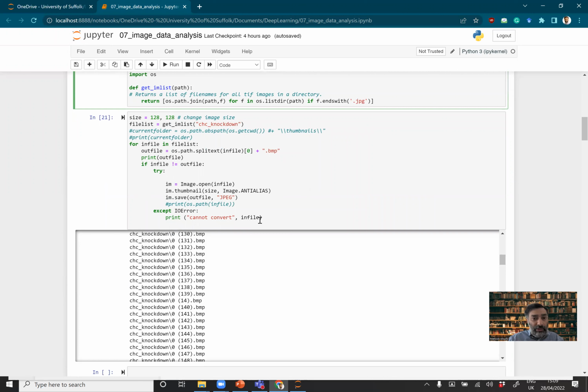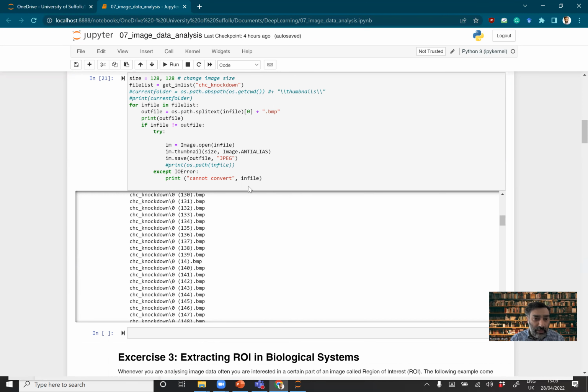You could have 1,000, even for your assignment, you might have 10,000 images to process. So if every time you apply things to these 10,000 images, that could take hours and hours, right? So you can take just 500 images, convert them into smaller size images, and then have your code pipeline and everything working. Have a look at what the images look like. If you're happy with all the code and the pipeline all working, then you apply it to full size images.